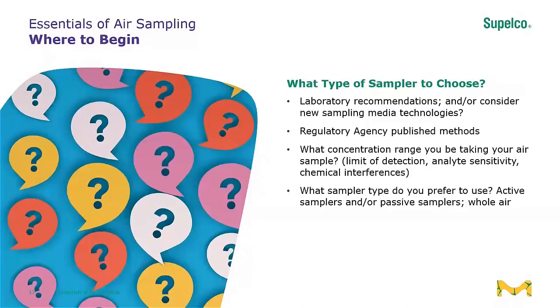Also, the regulatory agency published methods. I put a slide up a few slides ago that listed some common regulatory agencies and their methodology. Please also check there for the sampling device that they recommend.